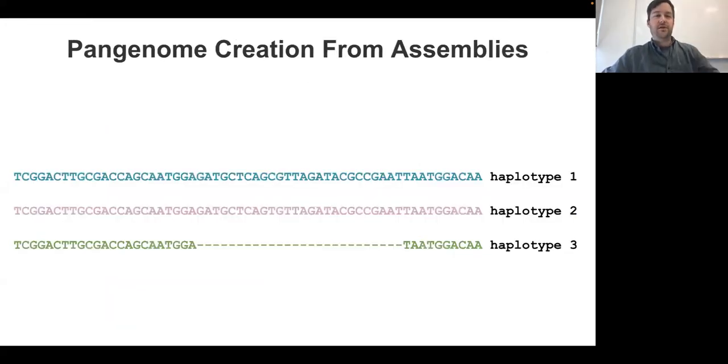Okay, so just to motivate the final example that I'm going to show in the last part of what I'm talking about: today I'm going to show you one of the workflows that the HPRC produced, which is a short read mapper to a pangenome. So I'm going to motivate the use of a pangenome really quickly.